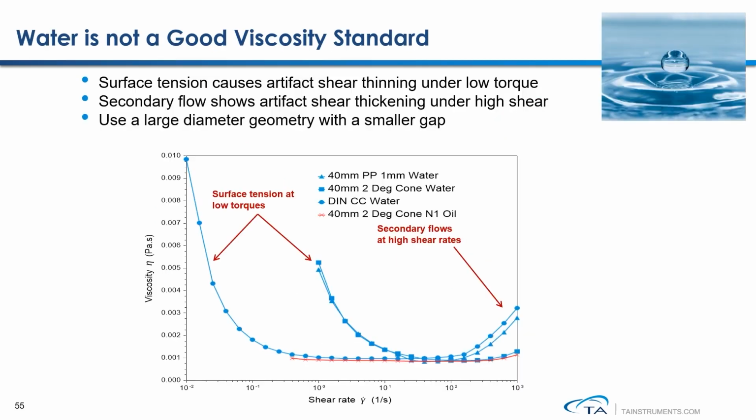So far, we have introduced 4 commonly used flow procedures to measure the viscosity of liquid samples. Flow measurements are relatively easy in a rheological test. However, if you did not select the correct geometry or did not program the test using appropriate test parameters, very possibly you will observe some artifact wrong results. Testing the viscosity of water is a very good example to show you that if you did not select the right test parameter range, you may very possibly observe some artifact results.